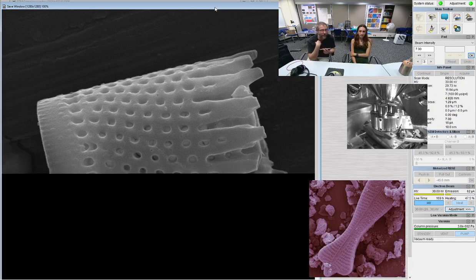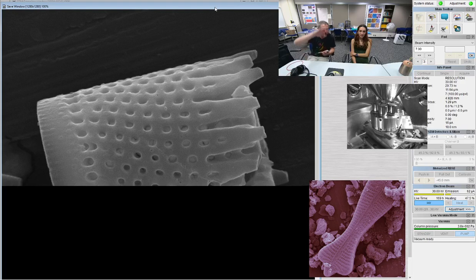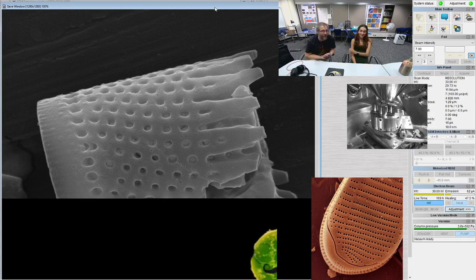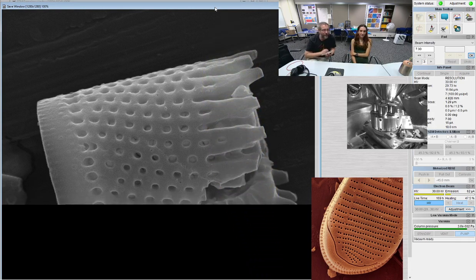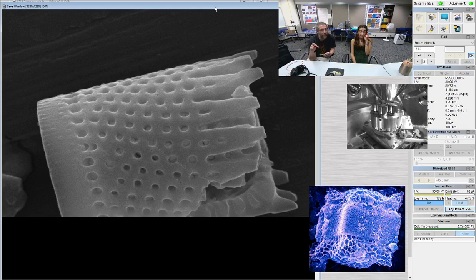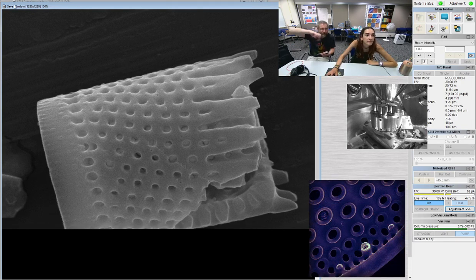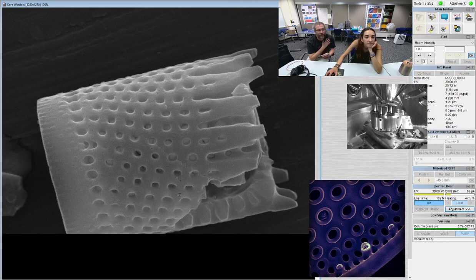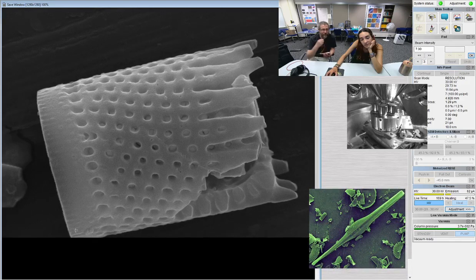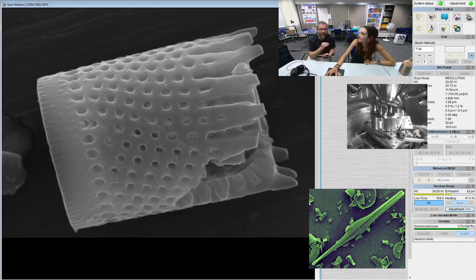It's a little bit like being at the doctor's office. If you go to the doctor's office and you have astigmatism in your eyes, this is how they fix it, right? They put it in front of you and say better, worse, better, worse, and you just pick between the two until it starts to be clearer. So effectively we do the same thing. Our stigmation will allow us to fix the X direction and then the Y direction, or the Y then the X, but you can handle them independently. So we'll fix it in the vertical direction, fix it in the horizontal direction, and then your thing should go from being egg-shaped to being perfectly circular. It'll also fix all of your focusing, because when your stigmation's off, things that are slightly out of focus start to take on an egg shape that should be round.